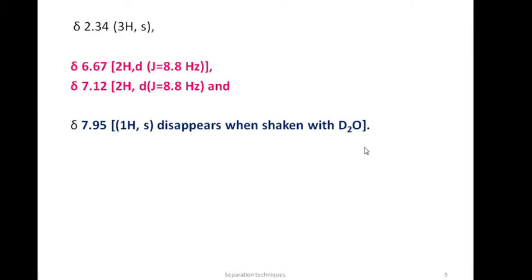One is when the proton is acidic. It can give away the proton to the solvent. Or it should be basic, like ammonia, where there will also be exchange of protons. So these are the things you have to keep in mind. This is aromatic, this is CH3, and this one is something else. Let us see what it may be.